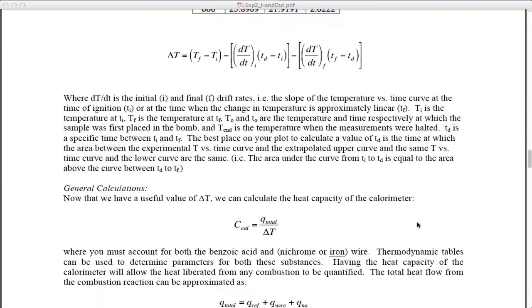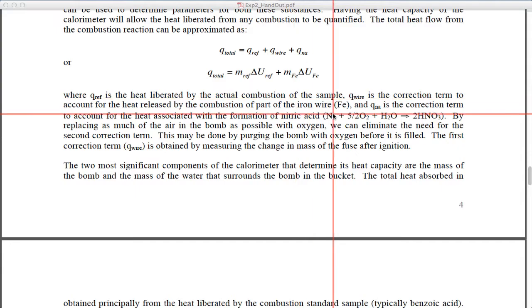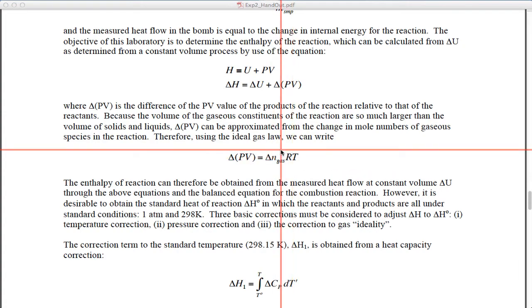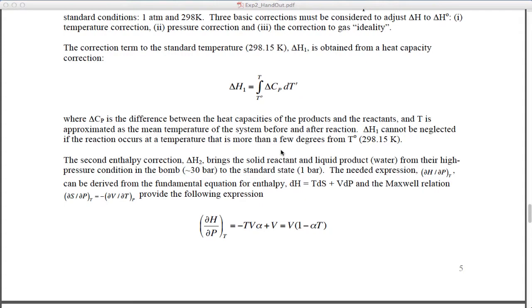Okay, and so I provide that as well as some general thermodynamics for what you're considering when you're doing these reactions. I also provide some of the general correction, the PV term correction, so that you're not specifically at 1 atmosphere of pressure. So this is how you make those corrections, since you were asked to calculate the standard state heat of formation.